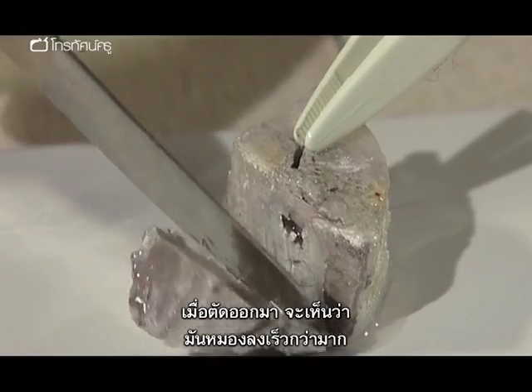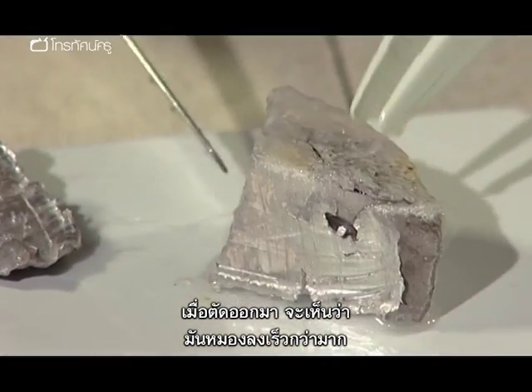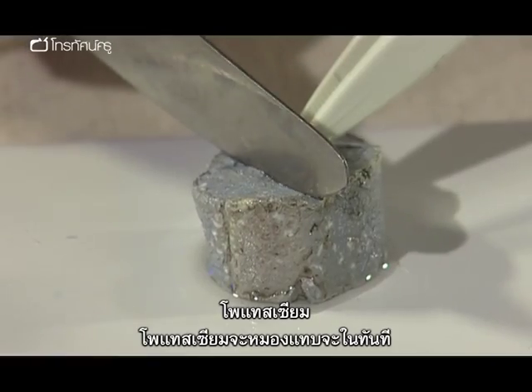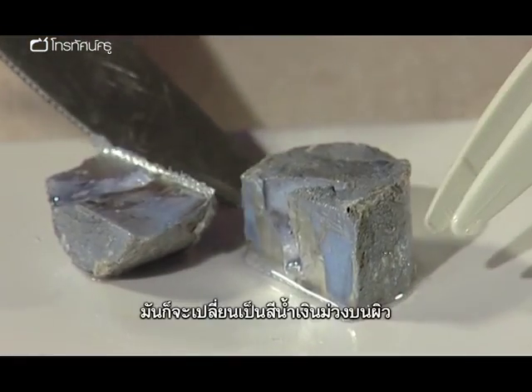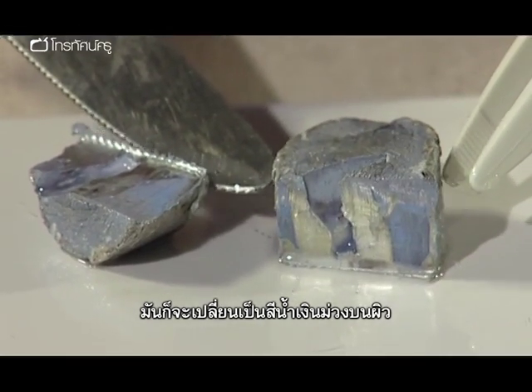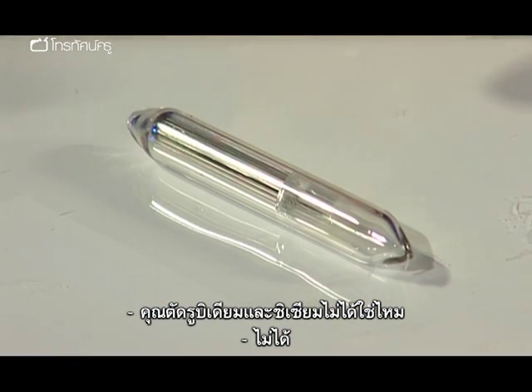And if I just cut a slice off there, you'll see that that tarnishes much more quickly. You can see the surface is going. And the potassium's really easy and tarnishes almost immediately. If you just move the oil off the surface, you can see the bluey-purple tarnish on the surface. Now, you can't cut rubidium and cesium, can you?